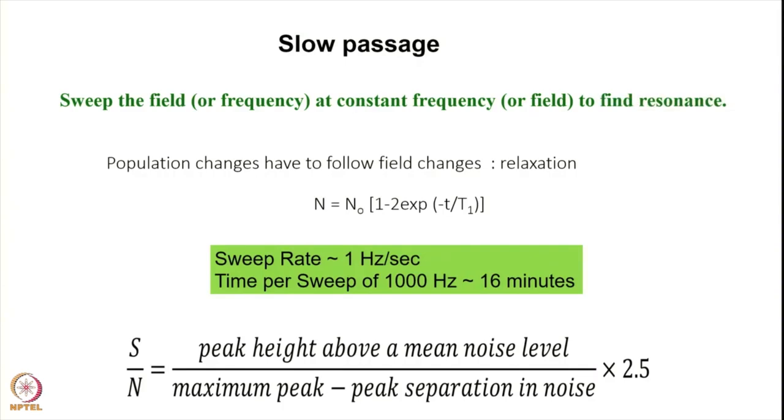Okay. Now we turn to the next question. So far we understood the NMR parameters in the NMR spectra. We also understood the principles of NMR, and how the spectra will look like, how many lines are there, and what is the source of all of these lines. Now how do we measure it, how do we know?